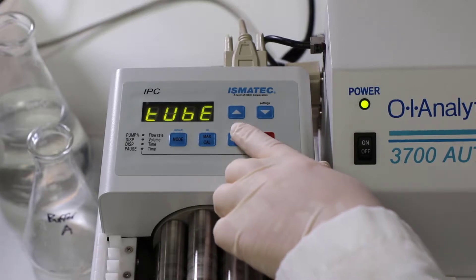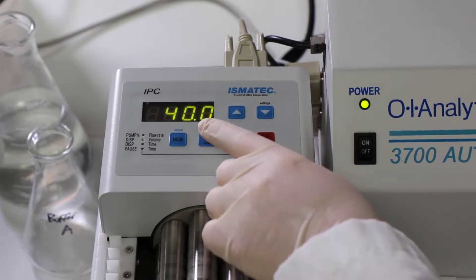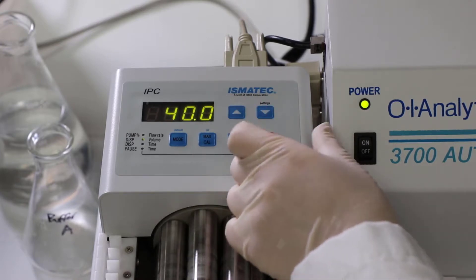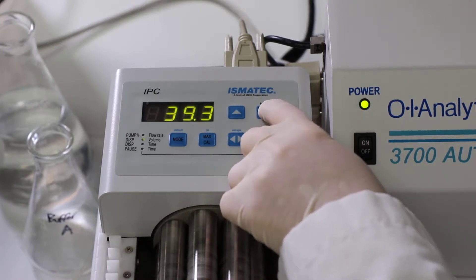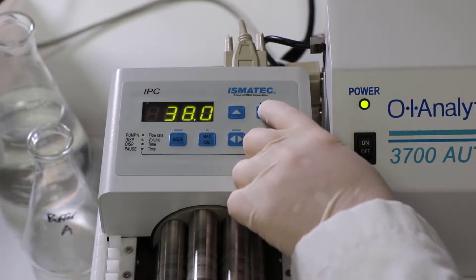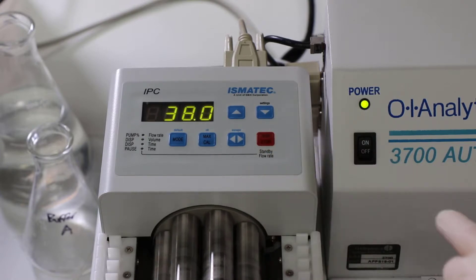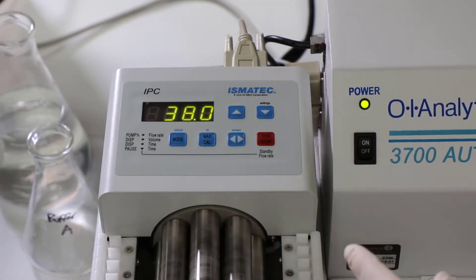From here you're going to hit Escape, and this is where you can set the speed of the pump. So we're going to put it down to 38, and then from here you can hit the Run Stop button, and it'll begin to move at the speed that you specified.